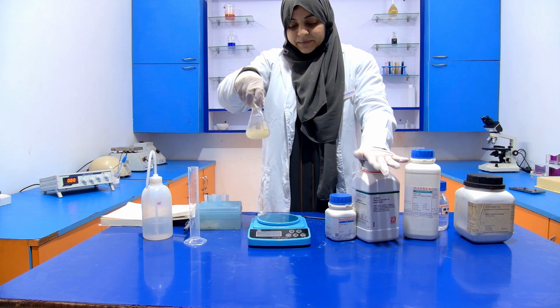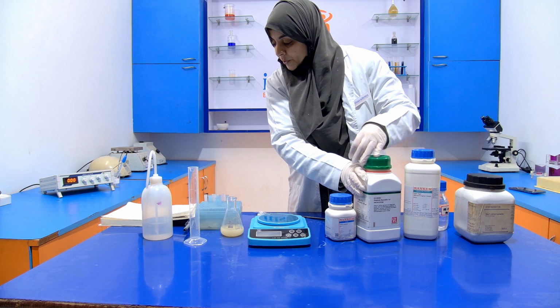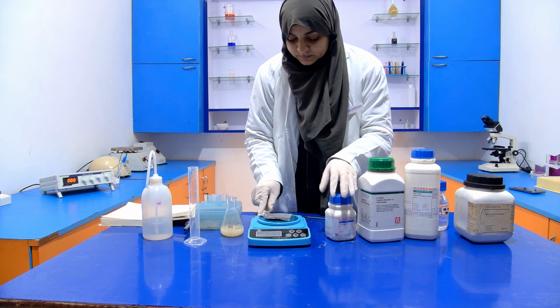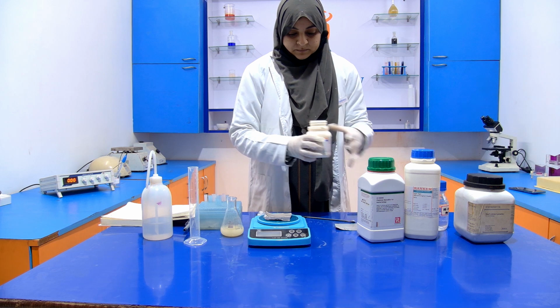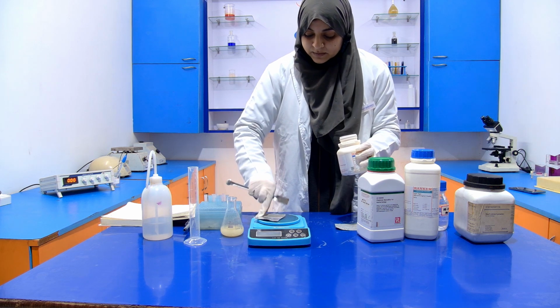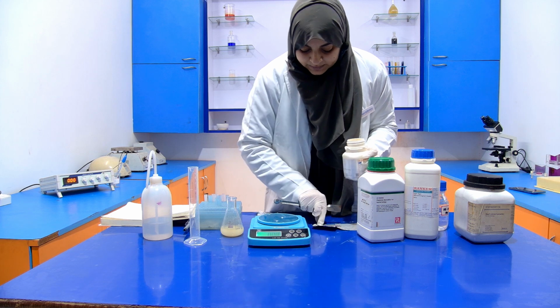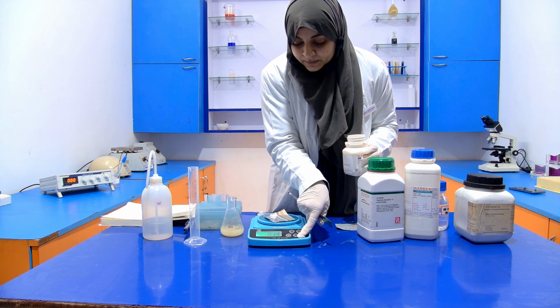Now the next ingredient is your NaCl. NaCl also requires 0.5 gram. Again we have to take the weight of that aluminum foil and tare it.